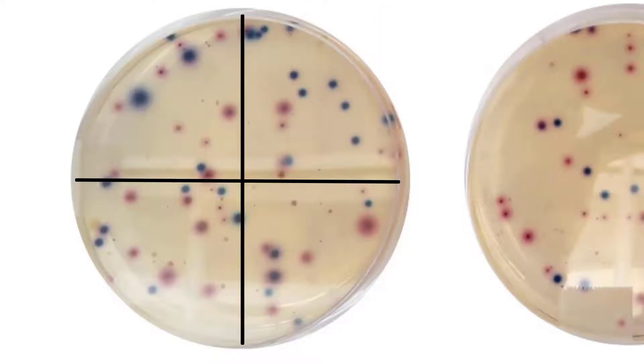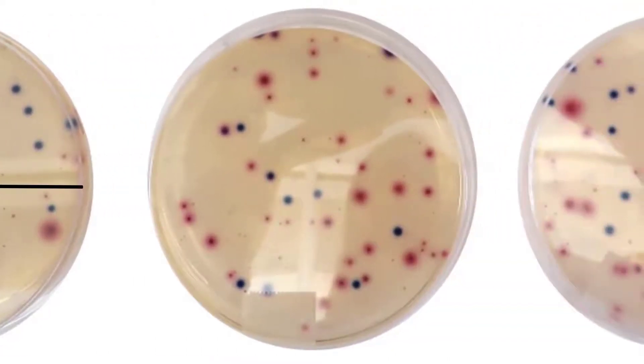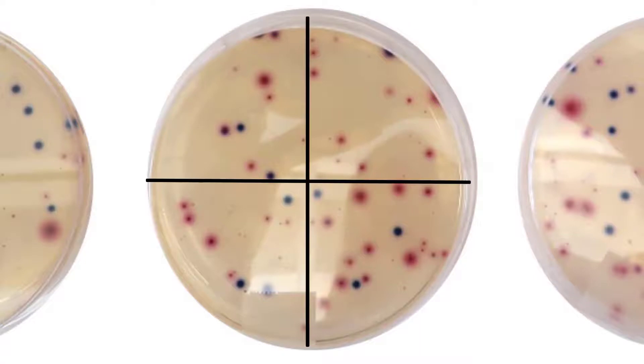Let's move to the second plate. How many E. coli colonies do you count? Let's count together: 1, 2, 3, 4, 5, 6, 7, 8, 9, 10, 11, 12. There are 12 E. coli colonies on this plate.